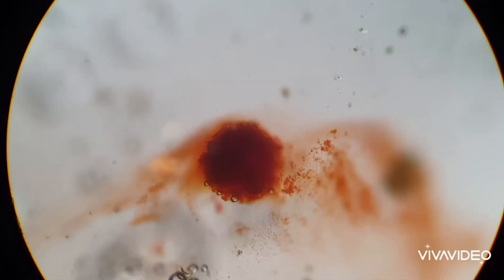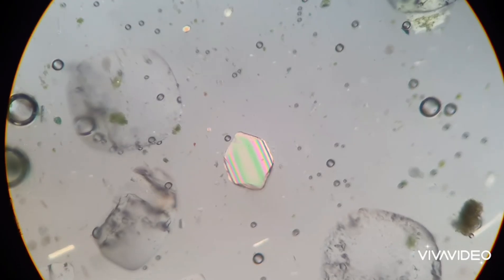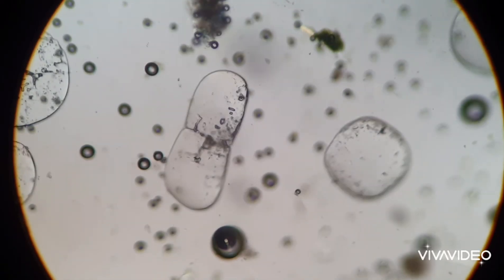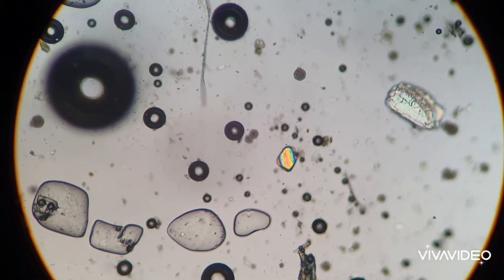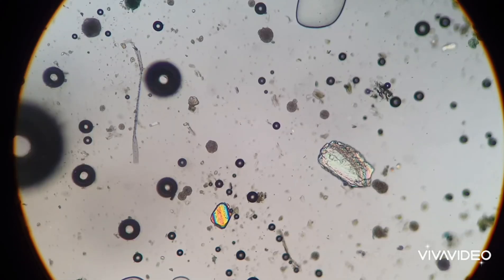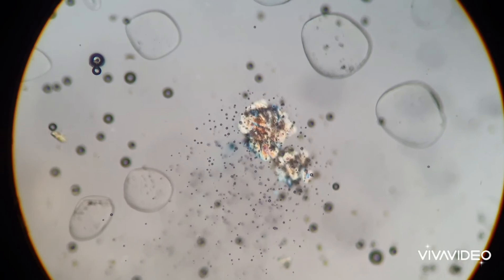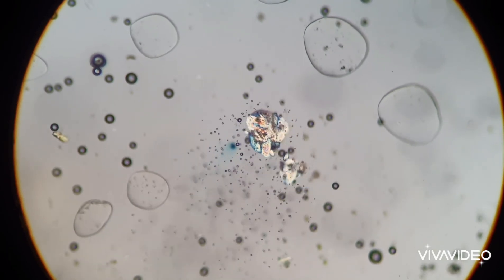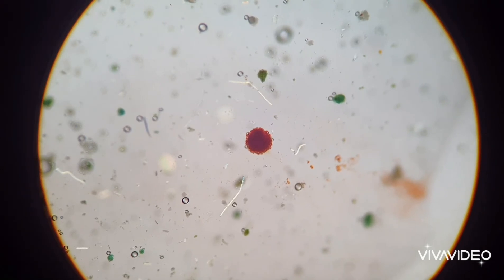I'm super excited to be looking at sea monkeys under the microscope, and I hope you can join me on this journey. According to the instructions, the sea monkeys in this packet are a result of crossbreeding, and the instructions claim that they are a super hybrid. They are essentially supposed to live longer and grow larger than natural varieties of other brine shrimp. So I guess we'll see what happens.